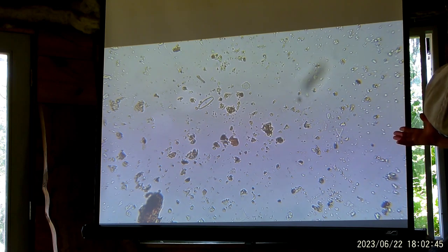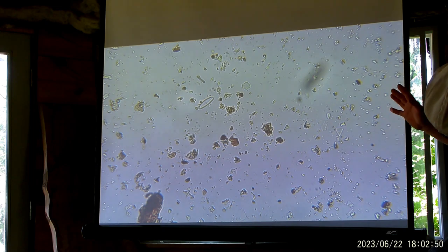But if you're making teas and extracts, particularly teas, when you're feeding these, the movement's insane. When you give them food and get them going, it's not this Brownian motion that we're seeing anymore. You'll see they're moving, and it becomes very apparent.